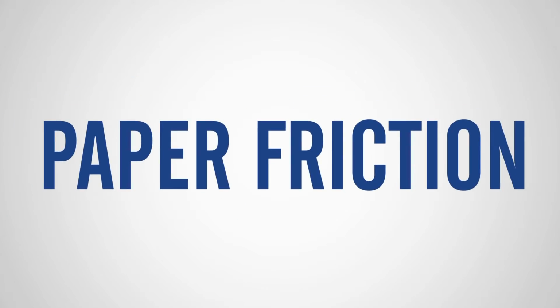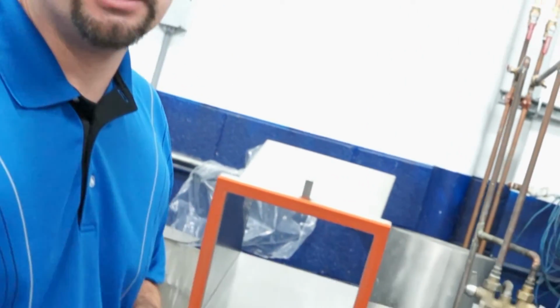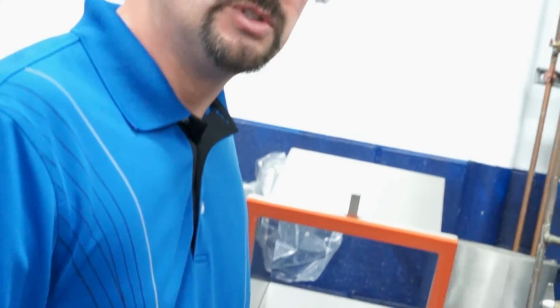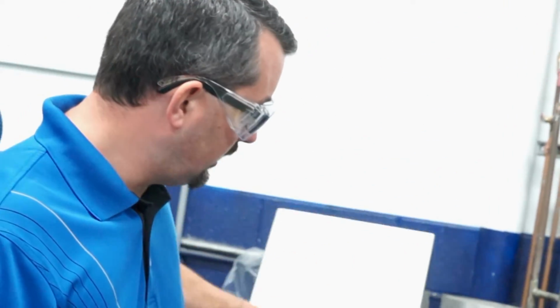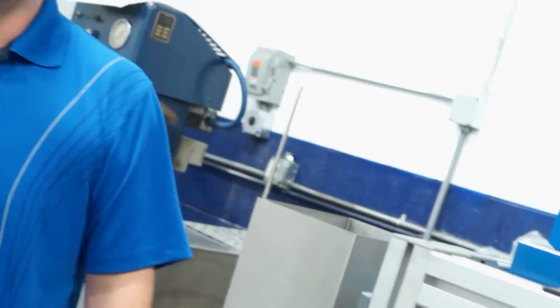Now we're in our hand sheet paper lab. We have the ability on site here to make all of our new paper formulations as hand sheets and test them on our dynamometers. So this is the hand sheet where we actually start with a slurry, dump it into this chamber, and remove the water by a vacuum process. And we can then press the rest of the water out on this new press that we have. And at that point, it's ready to be.